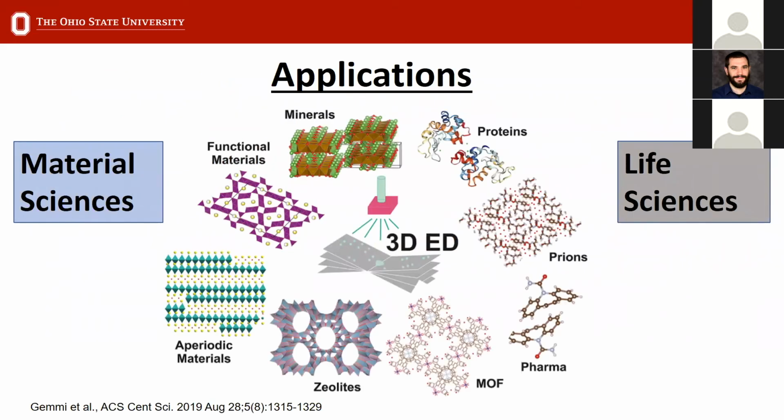Now, I would like to give you an overview of the potential applications. There are applications in material sciences and in life sciences. In the life sciences, we think about proteins, prions, small molecules, and in material sciences, it's minerals, functional materials, aperiodic materials, zeolites.